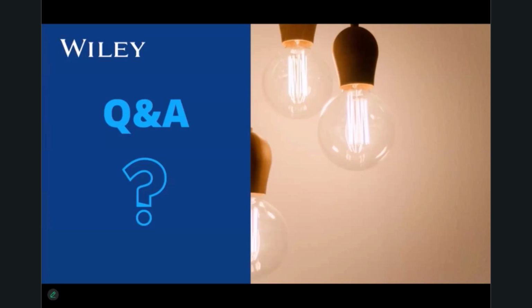In this case, one way to do it is you can create a hit list that always has those compounds. That's option one. Option two is you create your own databases, and then option three, you keep those files. Option three is useful when you have a mixture. You always have those compounds in your mixture. You want to find the unknown component in your mixture. Then in this case, you should keep files and then add into the, I think there's an option when you do mixture analysis, as in must exist component. So that way you can carry on your search just for the unknown portion.